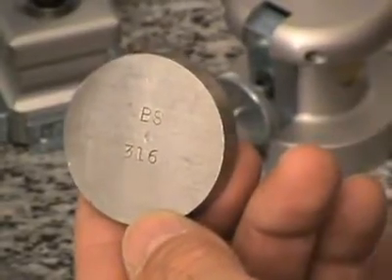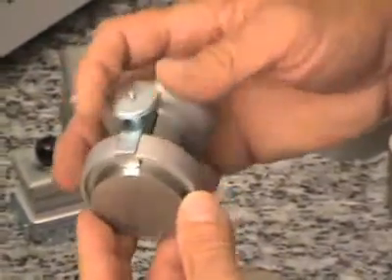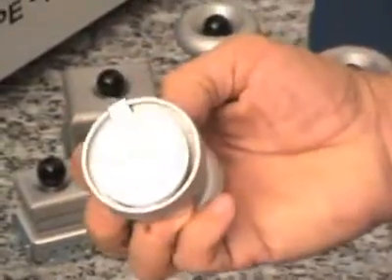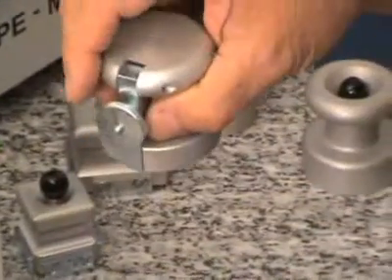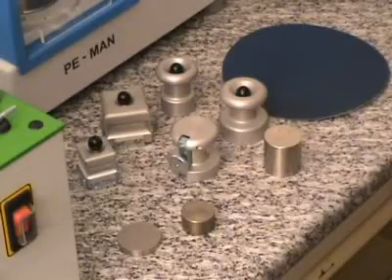Non-magnetic samples like this austenitic steel are fixed with a mechanical sample holder. Here you can see a selection of available sample holders for different sample sizes.